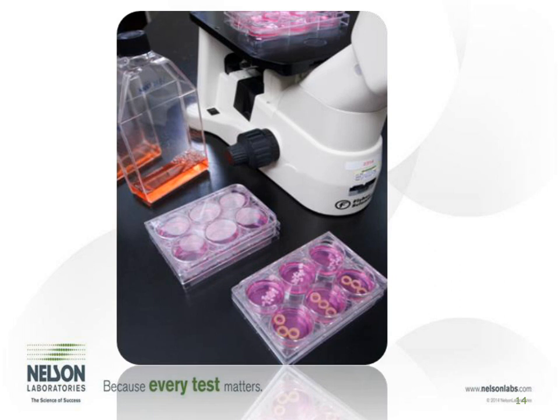And that's why, if you remember a couple of slides ago, we talked about the 37 degrees for 24 hours. That media is why the cytotox is allowed to use those extraction conditions. The media has serum in it. It has other proteins that will start to denature if we increase the temperature or have too long of exposure. And those proteins, when they denature, will make the media not allow cell growth or not propagate cell growth. And so obviously we want the media to help cells respond, so we are able to extract at 37 degrees for 24 hours instead of the higher temperatures and longer times.